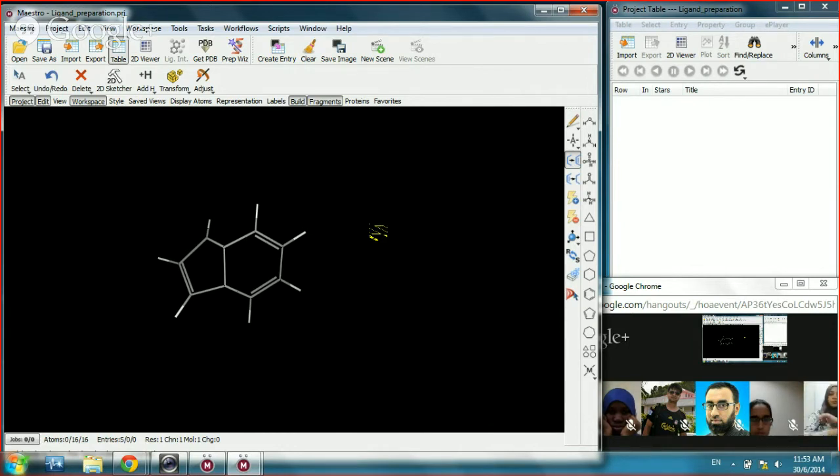Say for example, to make the carbon chain length here, we choose the option methyl here. You can see. And before I add, I would like to tell you that in this molecule you can see two colors, white color and gray color. The gray color represents the carbon and white color represents hydrogen.